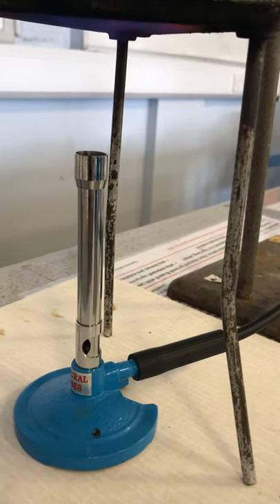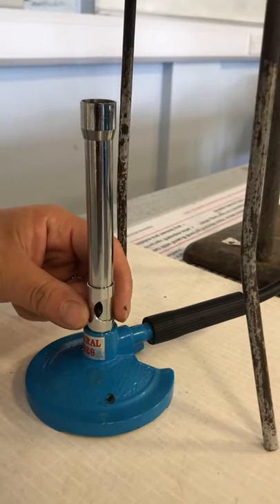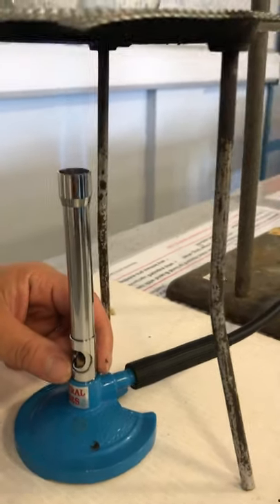After a minute, fully open the air hole of the Bunsen burner to speed up the heating process.